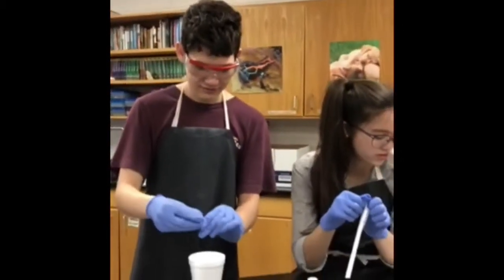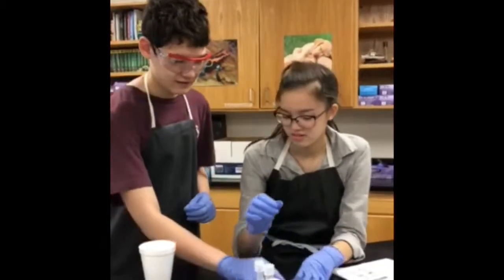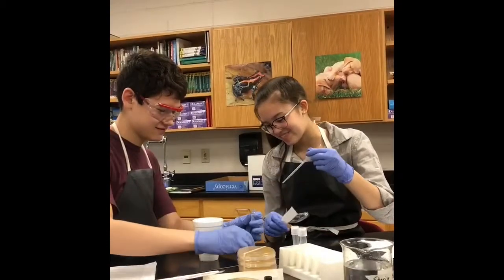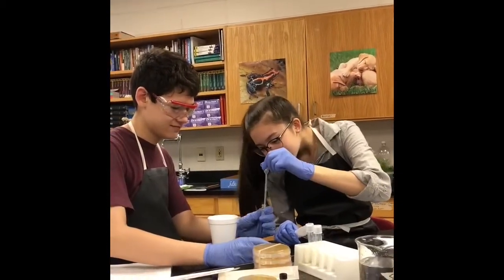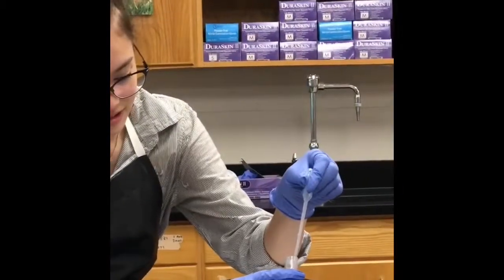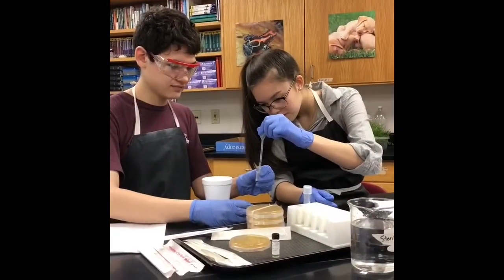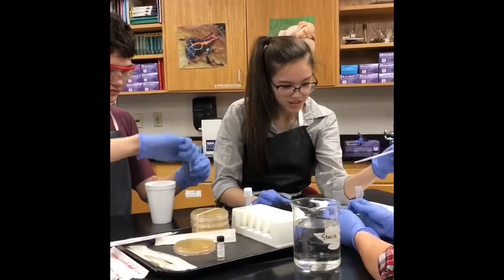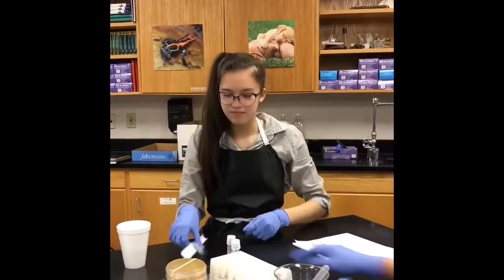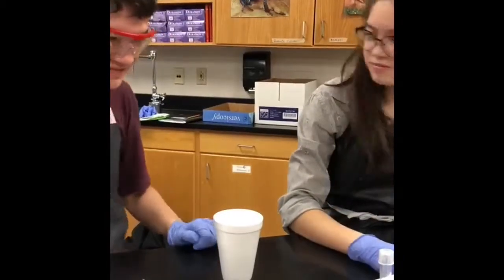First, mark two sterile 15 ml test tubes plus plasmid and minus plasmid. Next, transfer 250 microliters of ice-cold calcium chloride to each tube. Then chill both tubes in ice water.